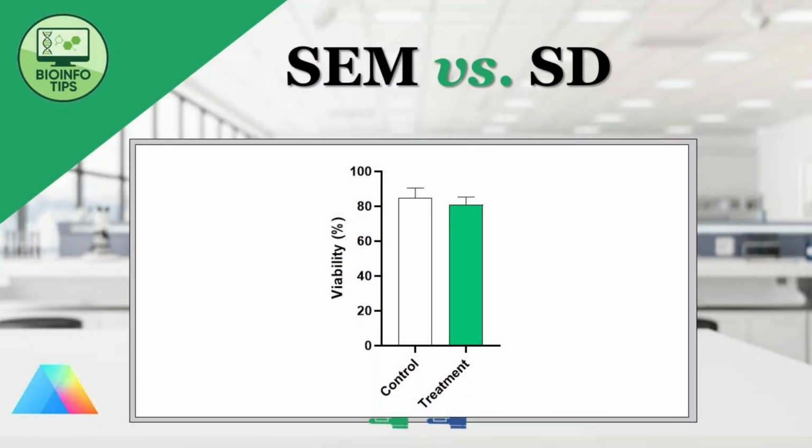If you use GraphPad Prism, there's a high chance you've already made this mistake, and reviewers spot it immediately. This video is the first episode of a new series, Common Mistakes That Get Scientific Papers Rejected. And today, we're starting with one of the most common and most misunderstood ones, using SEM instead of SD in your graphs. At first glance, this looks perfectly fine.